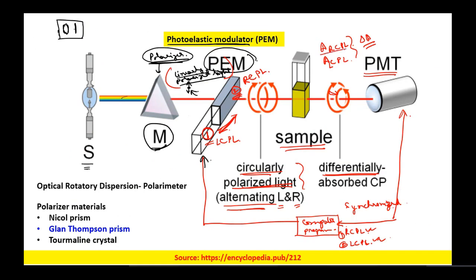What it is doing is absorbing the light in a differential manner depending upon its structure. So this is the difference.